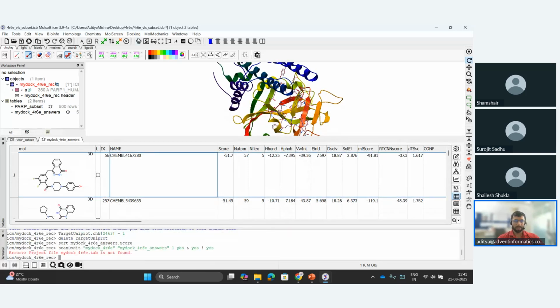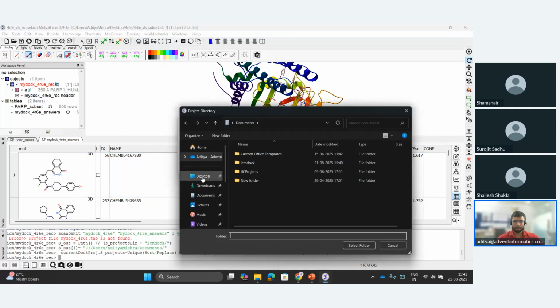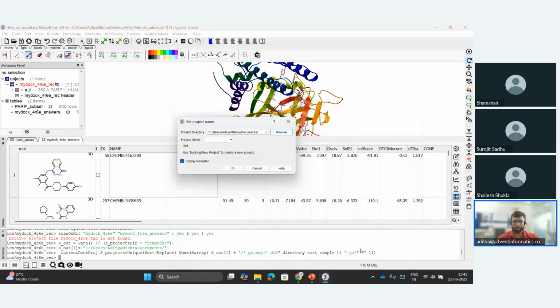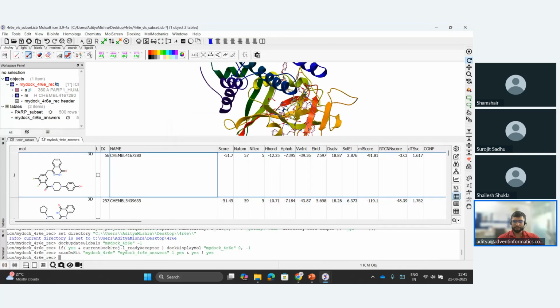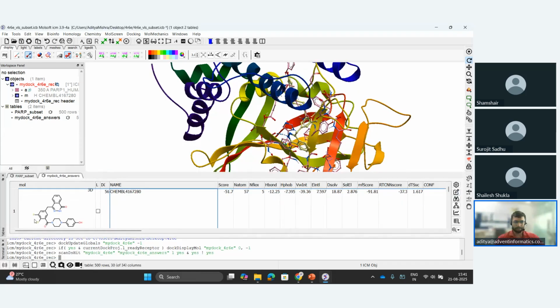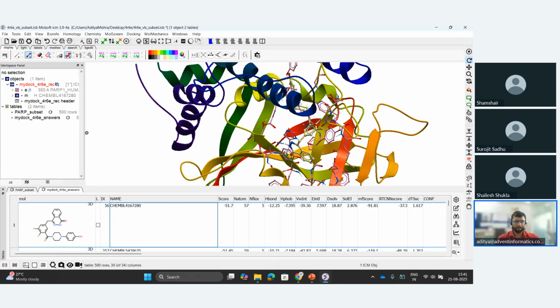Oh, before that, I need to import the same docking map. For that, you just need to select your protein or the maps where you have saved your docking. Okay, now when I click here, I have my 3D graphical window, and there I have the best scoring candidate, right? And it will be shown in M here in my workspace panel.